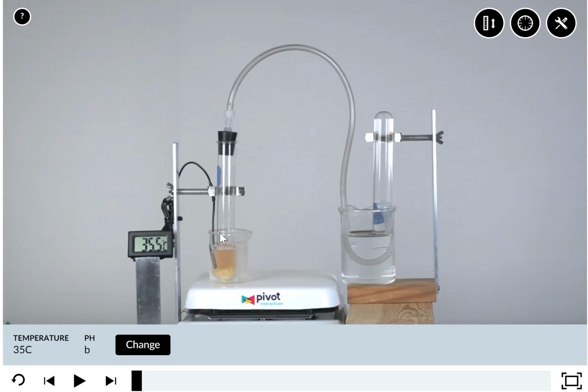Hi there. So this is a really quick tutorial on how to use the Pivot lab tools and what the setup is in Pivot for this lab on enzymes that you'll be collecting data for. So in your group, you're going to decide whether you want to test temperature or pH, right? It can't be both because a well-designed experiment only has one variable that's being tested. So your group will change one of these things and keep the other one the same.